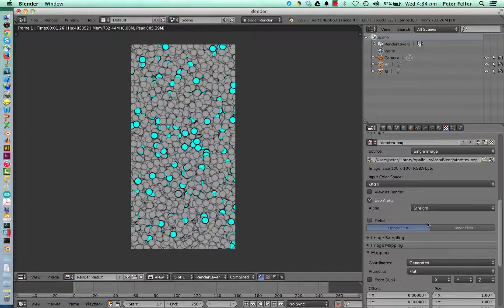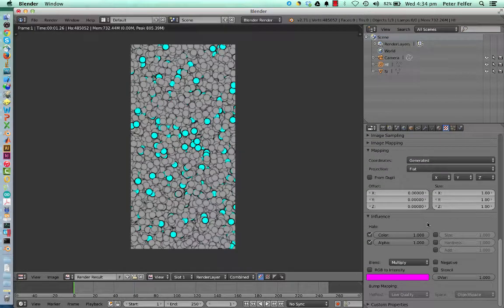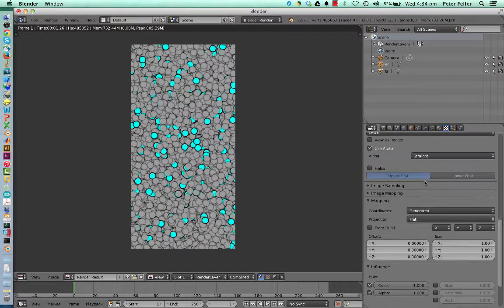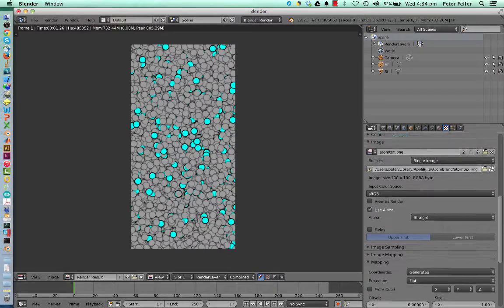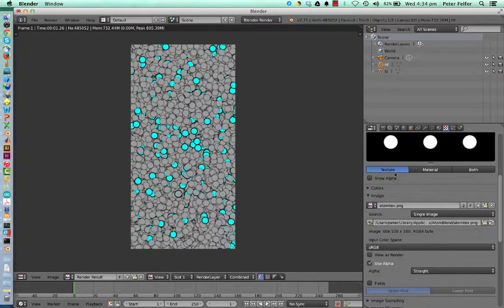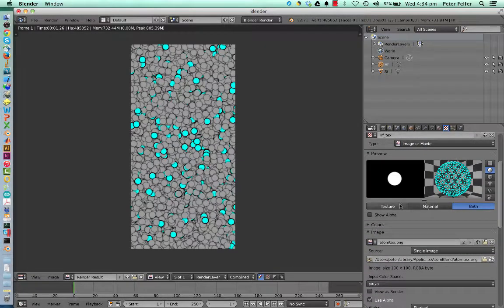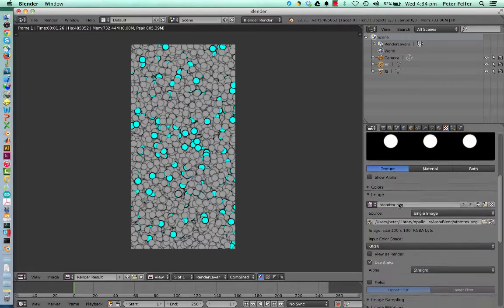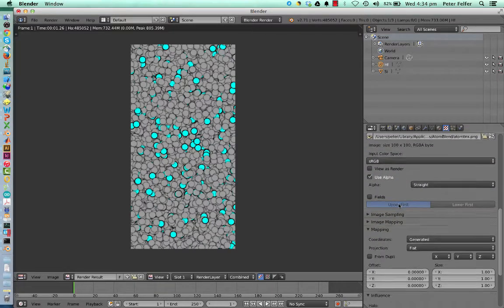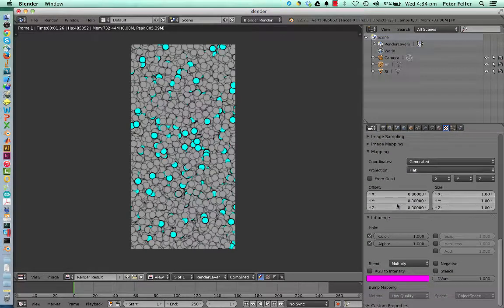So occasionally we'll need to do some troubleshooting as well. And it seems that I have actually forgotten what the difference was. Anyway, I'm not gonna dwell for too long on this, because otherwise I'm gonna waste the time. And if I find out what I did different, I'll just post it on the web page, and you'll be able to see that as well.